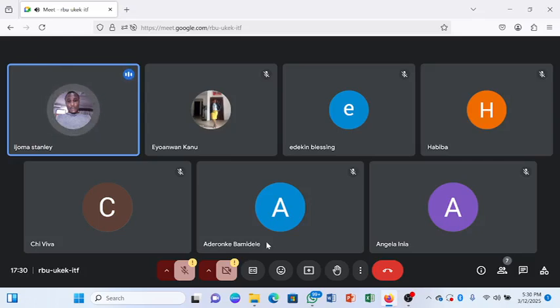PPEs, personal protective equipment, are goggles. We have goggles that they wear as PPE. This is to prevent splashes. Maybe you're taking a sample or the patient flings the hand, and it prevents blood from entering your eyes. Or in the case of droplets, you're taking a sample, this patient sneezes, it prevents it from entering your eyes, even if it might be drug administration or anything.